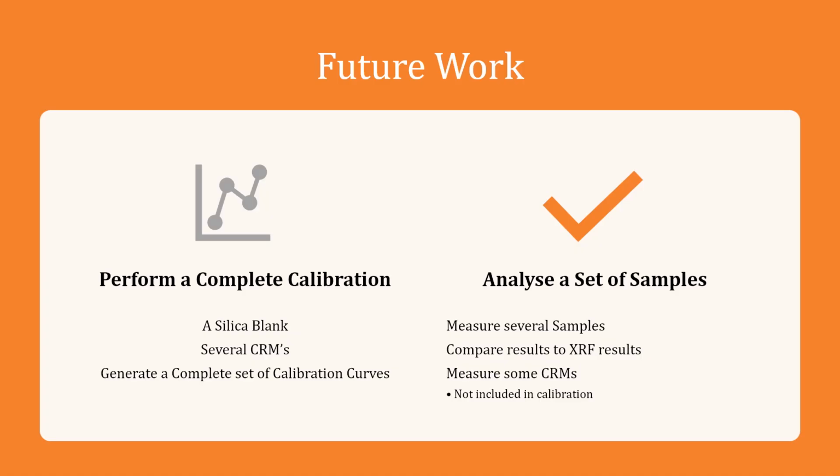So in future, what we'd like to do is perform a complete calibration based on a silica blank, several CRMs, and we want to generate a complete set of calibration curves. After that, measure several samples, compare the results to XRF results, and also measure some CRMs that were not included in the calibration.